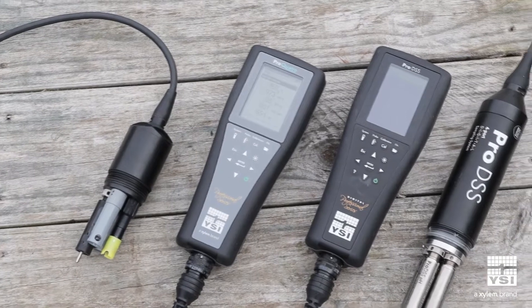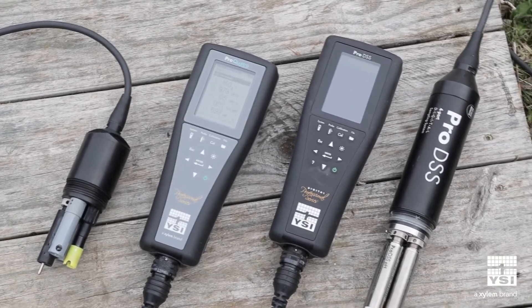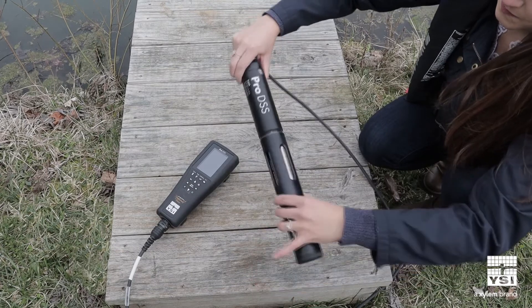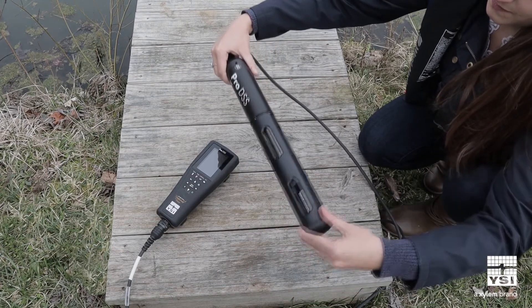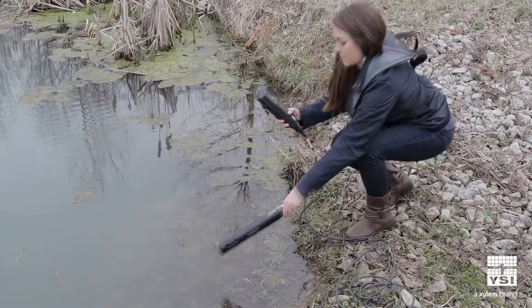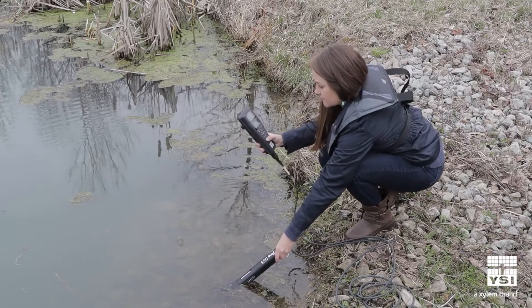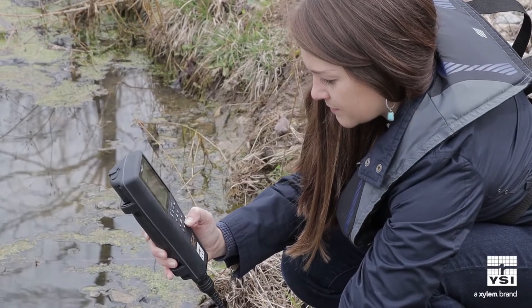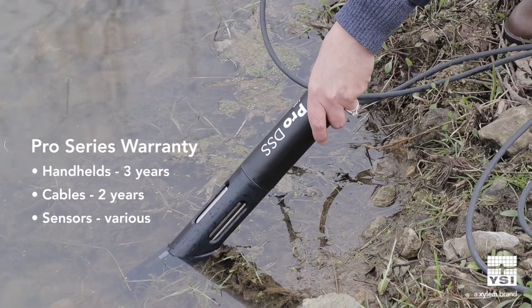As with all YSI Pro Series instruments, the Pro Quattro and Pro DSS are built with field use in mind. They are rugged, waterproof, and even float if they're dropped in the water. Both handhelds use field-replaceable sensors and cables to keep your instrument up and running and include an industry-leading three-year warranty.